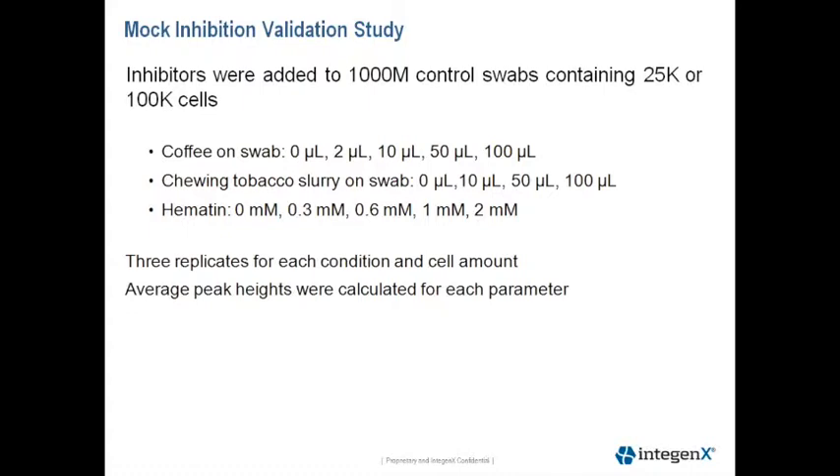For hematin, we suspended this in 0.1 normal sodium hydroxide, starting at 2 millimolar, and then diluted the hematin and loaded it at the concentrations indicated on the slide. Three replicates for each condition and cell amounts were tested, and the average peak heights were calculated for each parameter.